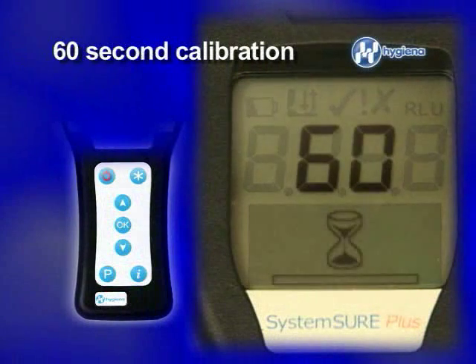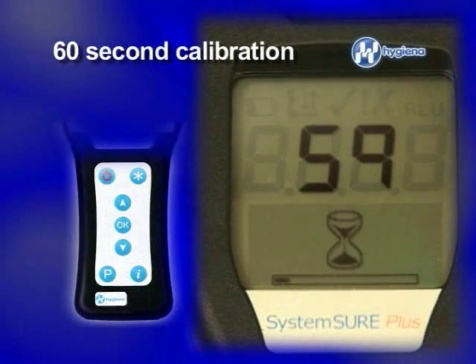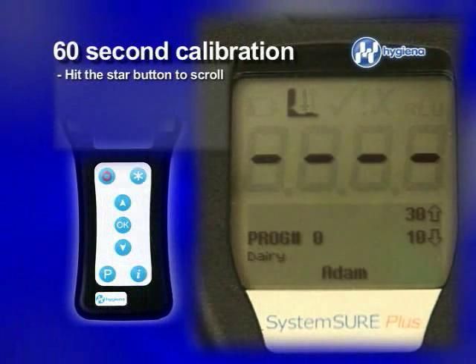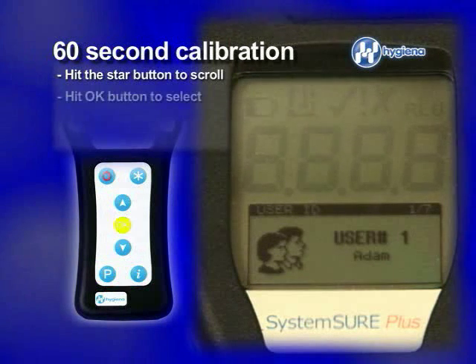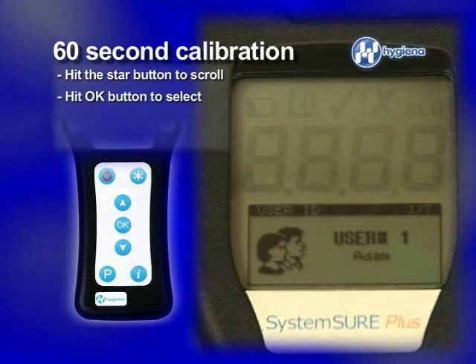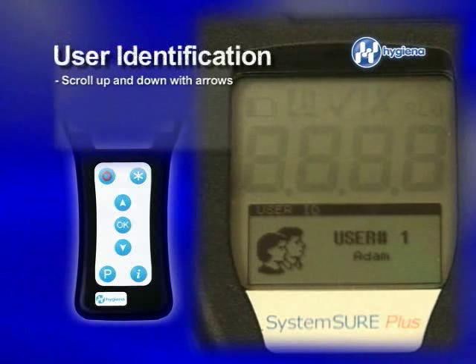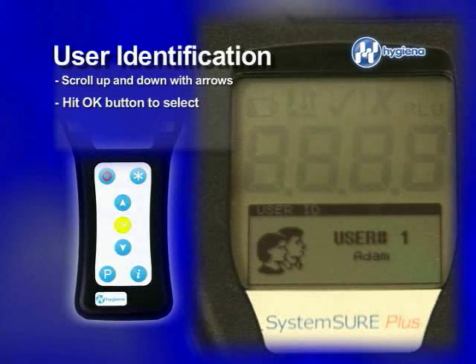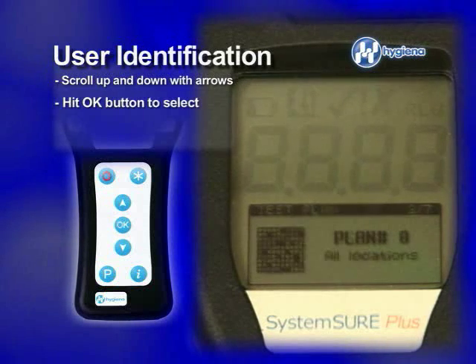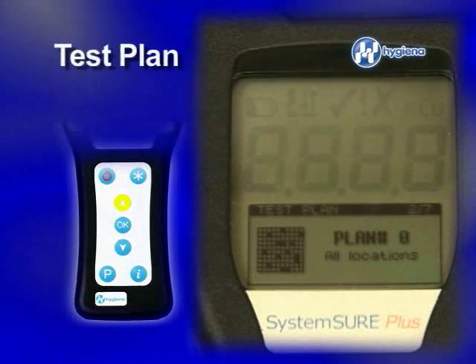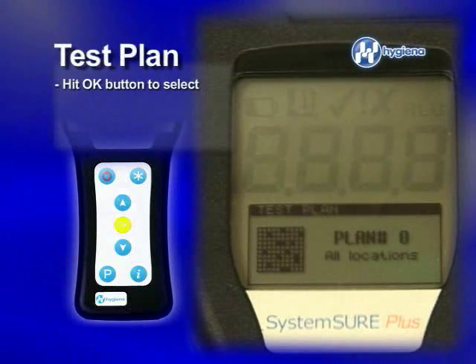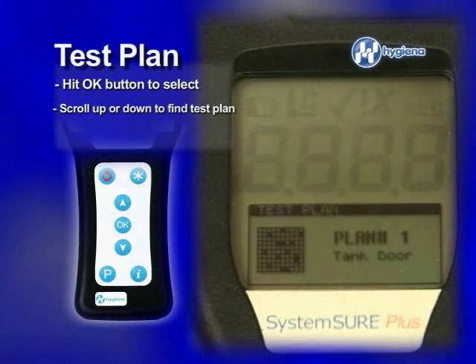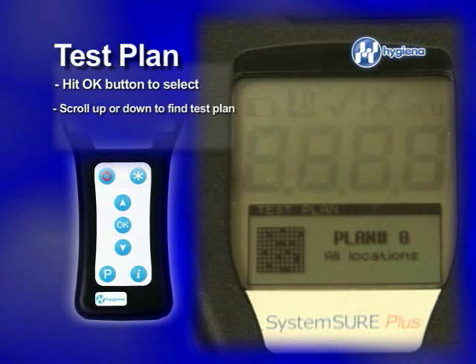When you turn on your System Sure Plus, allow 60 seconds to calibrate. To scroll through your device settings, first hit the Star button. To select a category, hit the OK button. This is your user identification. To select a user, scroll up or down with these buttons, find the name, and hit OK. To move on to the next category, hit the Up button. This brings us to our test plan. Hit OK again to activate and scroll to find the test plan you're looking for. Remember, everything but your thresholds are previously set up in your data software program and synced to your device.